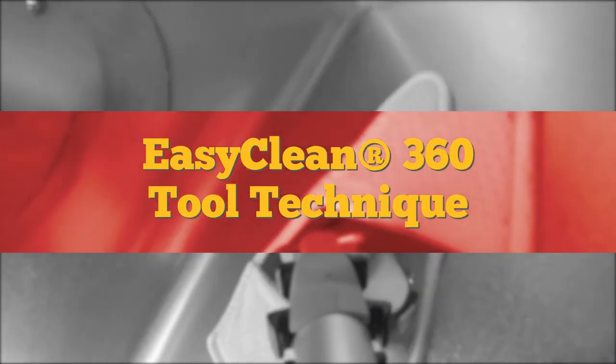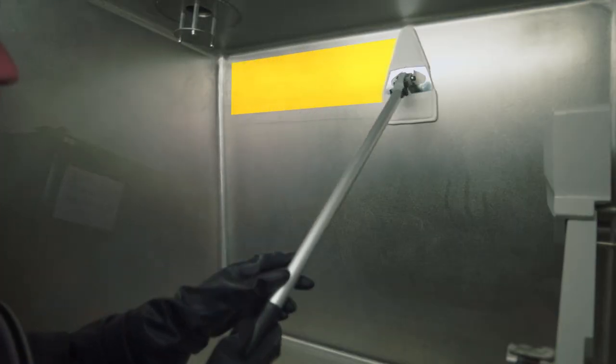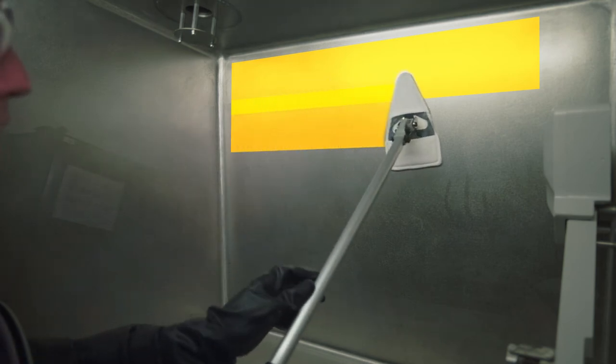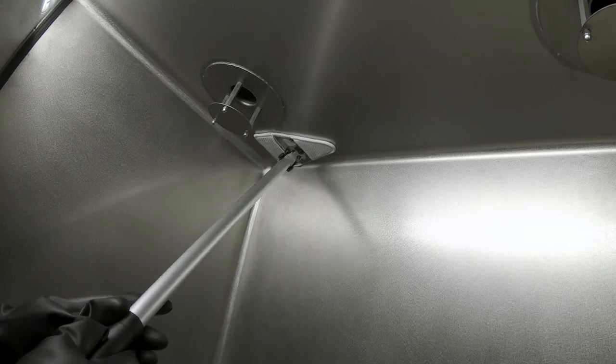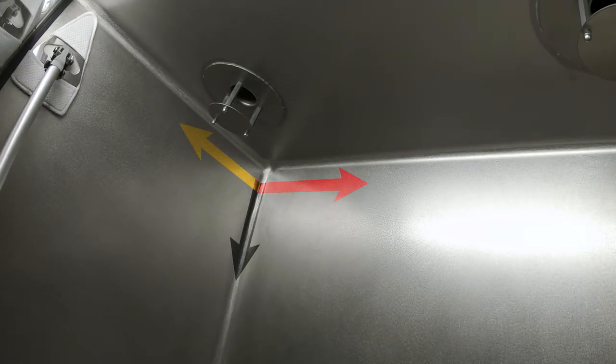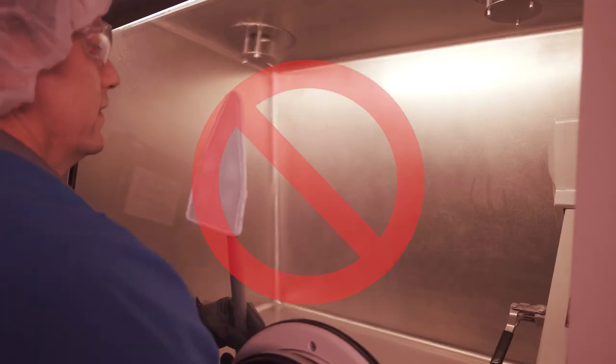EasyClean 360 tool technique: wipe in a straight parallel line with overlapping strokes. Clean left to right, top to bottom, back to front, cleanest to dirtiest. Never wipe in a circular pattern.